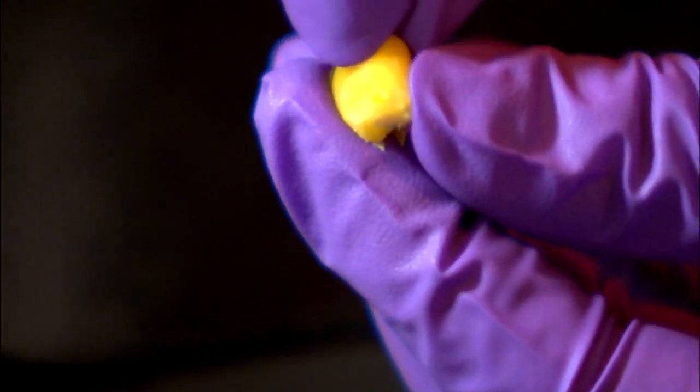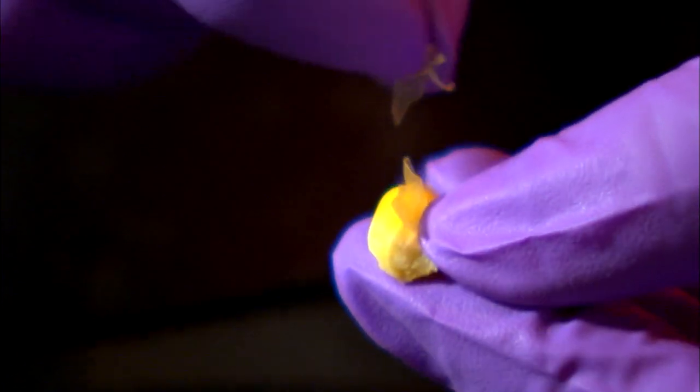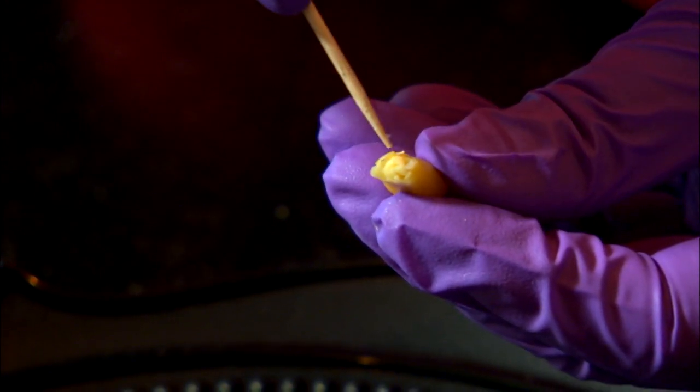As you pull it off, you'll notice the thin seed coat, or pericarp. Peel off as much as you can, observing how it covers the entire seed. The lighter colored triangle is where the embryo is located. Let's isolate this using a fingernail.